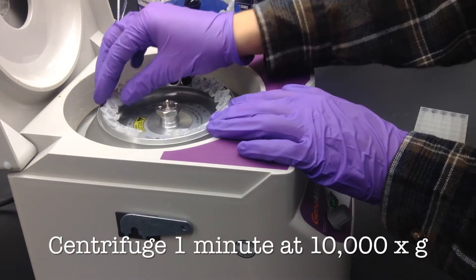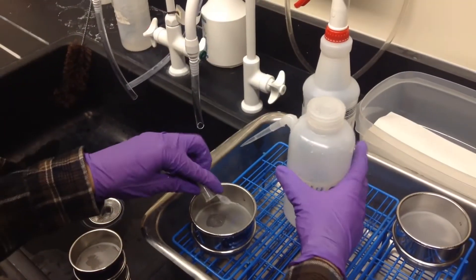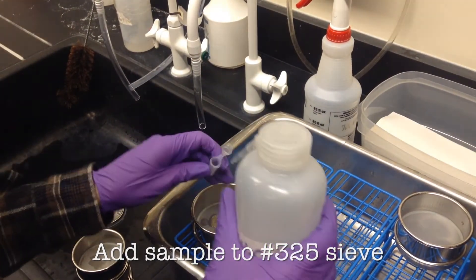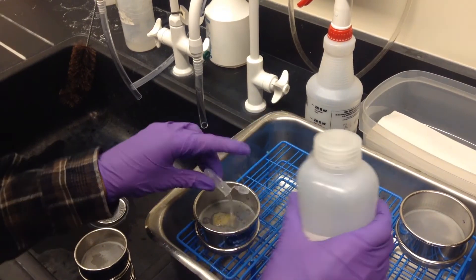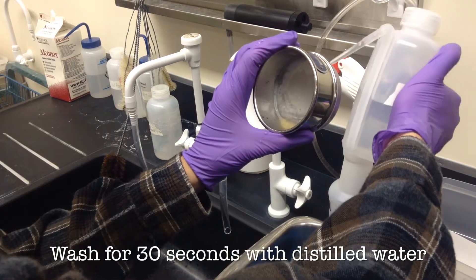After they've been vortexed we will centrifuge each sample. After the samples have been centrifuged we'll add water and run them through a sieve, washing the samples for at least 30 seconds with distilled water.